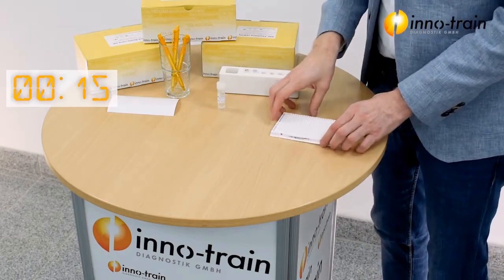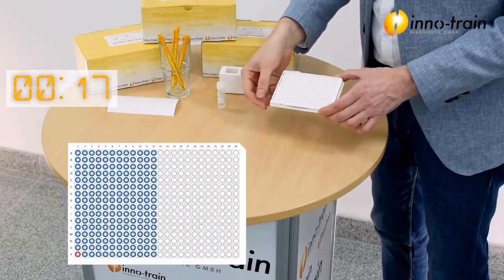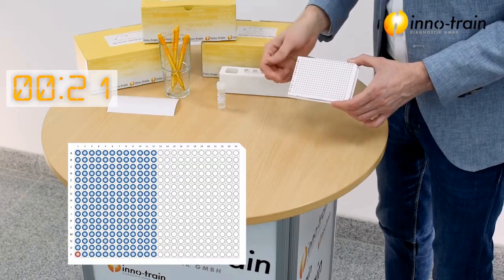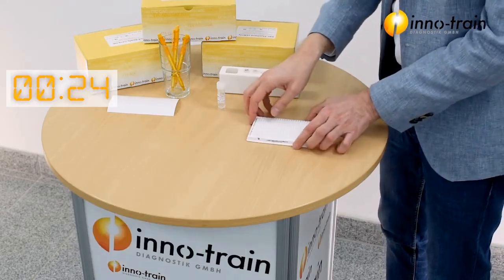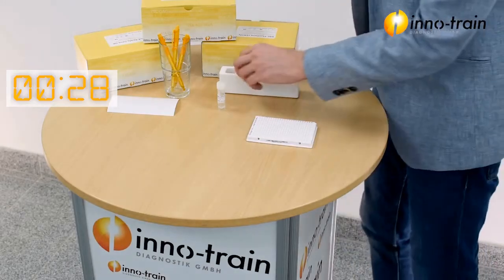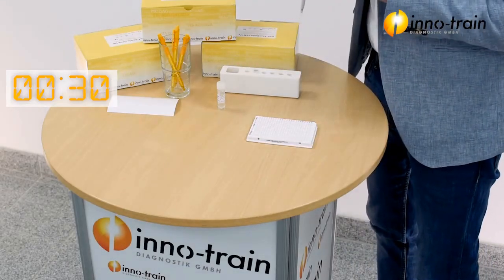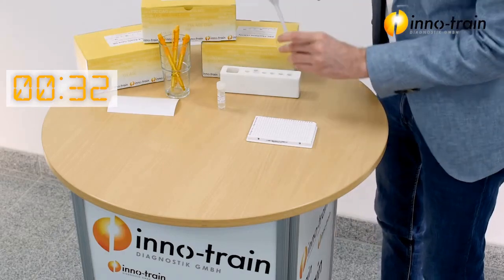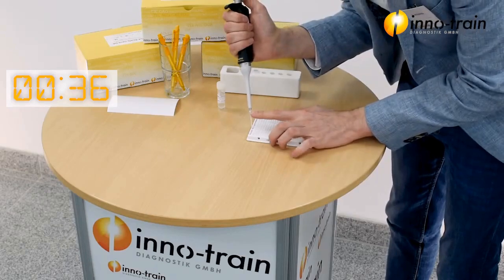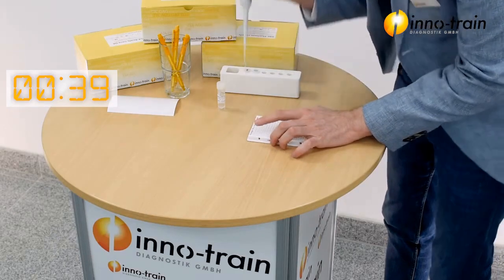All our mixes are marked in blue, except the negative control, which is in position P1 down here, and this is marked in red. To pipette the negative control, we need 4 microliters of water. I will pipette it in P1.